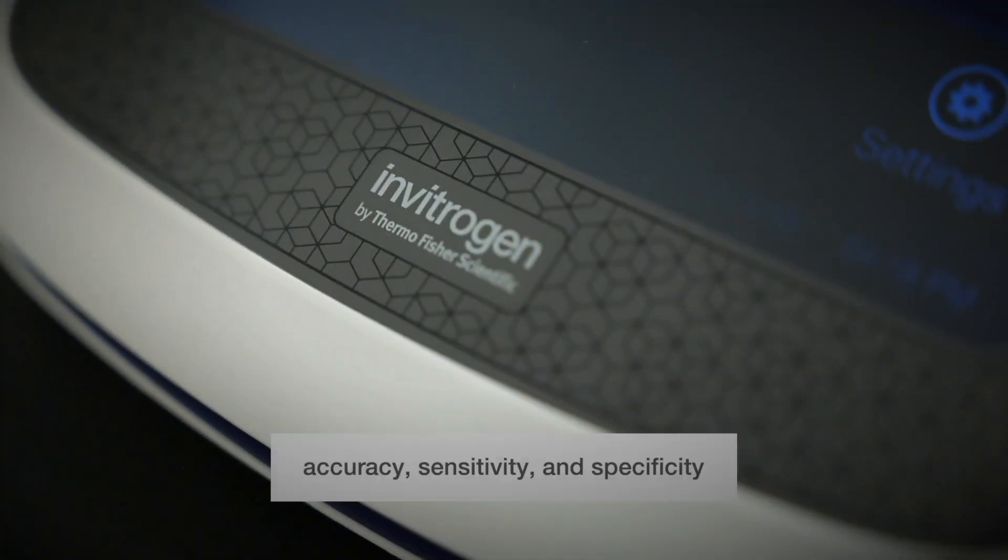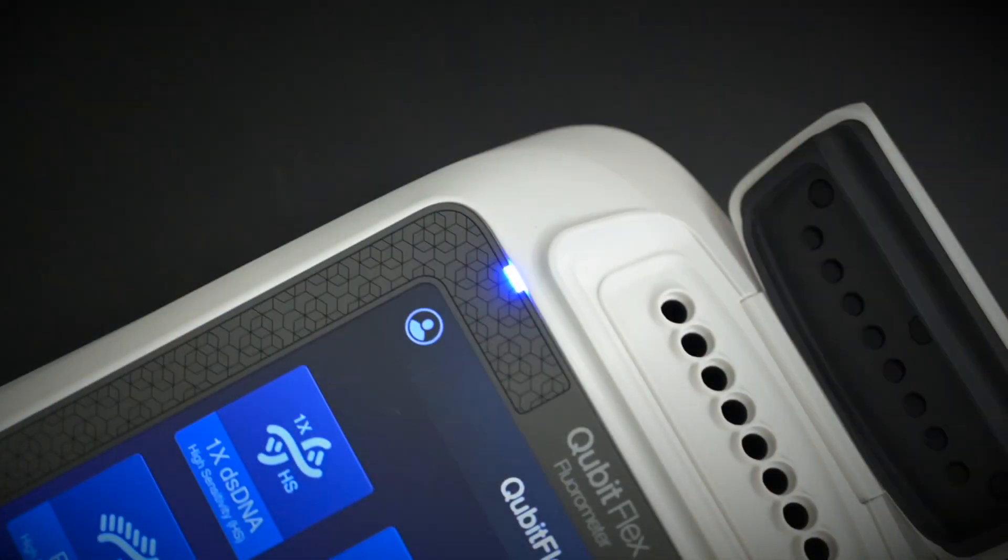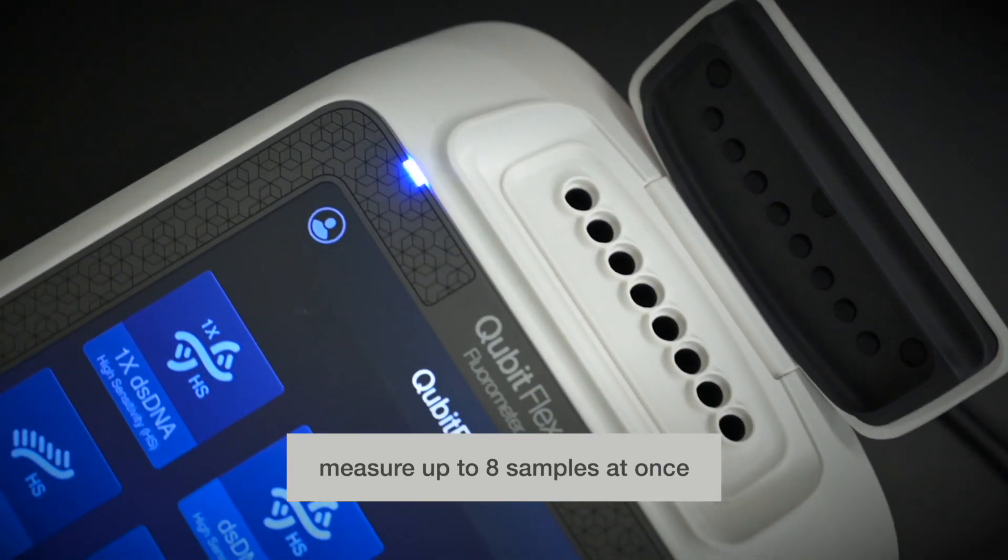The Invitrogen Qubit Flex Fluorometer delivers the same reliable accuracy, sensitivity, and specificity, with flexible throughput to measure up to eight samples at once.